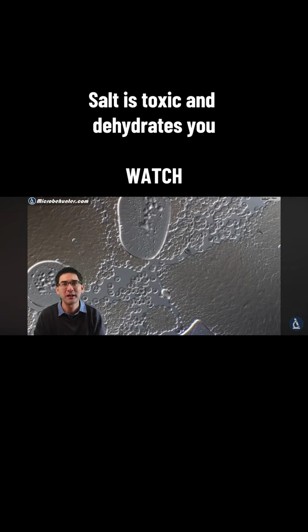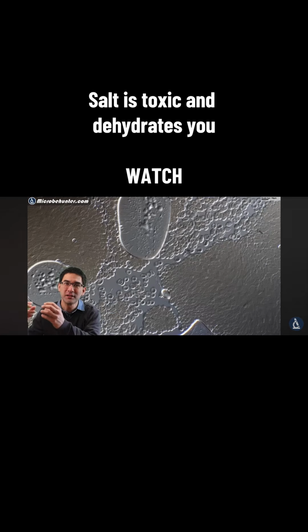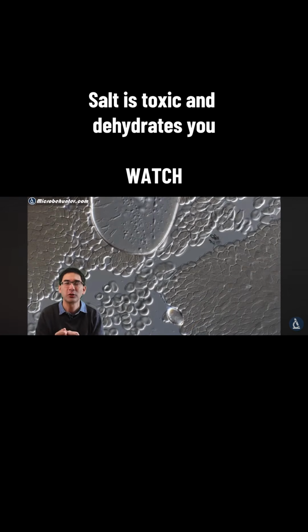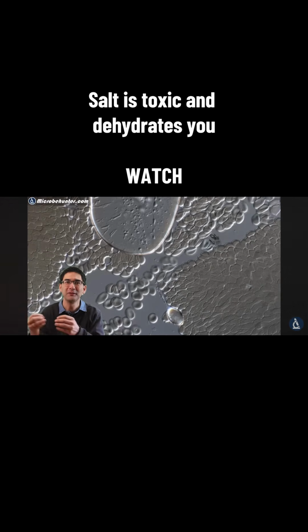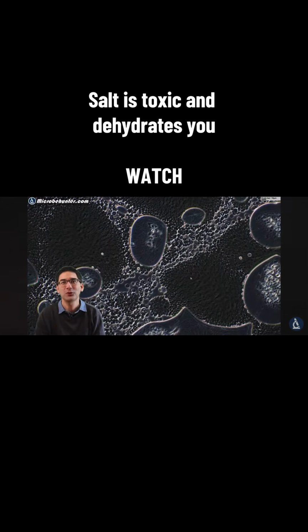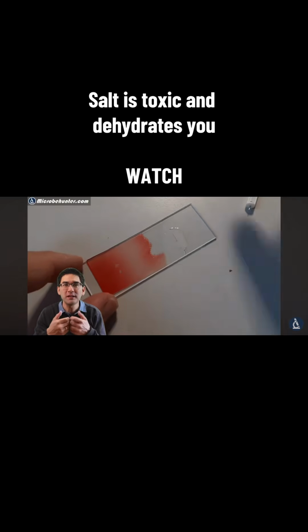And this is a very nice picture here as well, where you can see that there are some of the red blood cells streaming across the slide, and on the side, this is where the blood already started to coagulate and to stick to the glass slide. It almost looks a little bit like blood passing through a blood vessel. This here is in phase contrast, and I think this looks also quite beautiful.